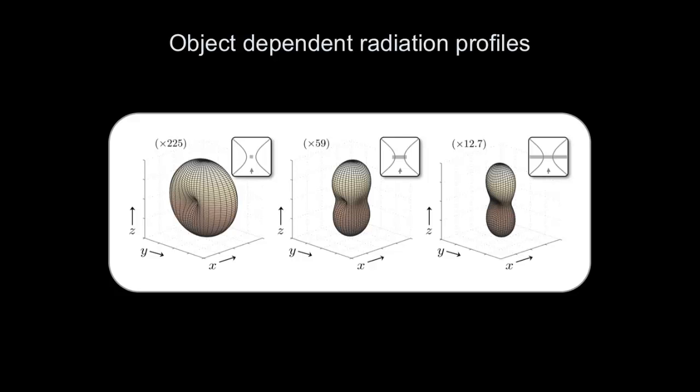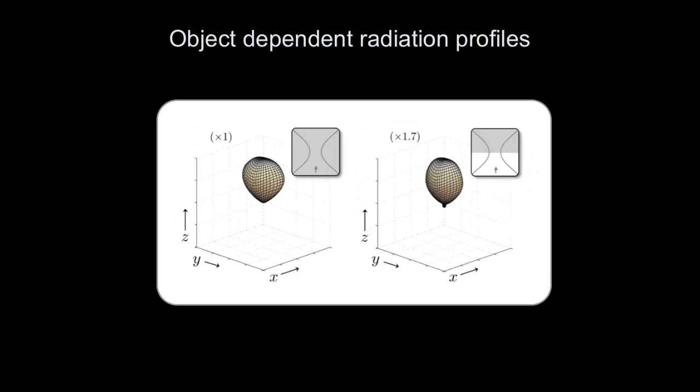If I actually make a plane of several molecules, I see the same kind of effect. It becomes a little bit more confined. It goes up and down. Same for a full plane, up and down. So emission goes up and emission goes down. Okay? But if I fill my entire focal volume with molecules, a lot of molecules contribute.